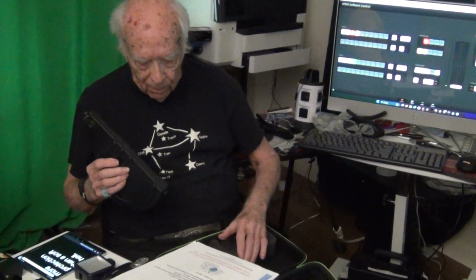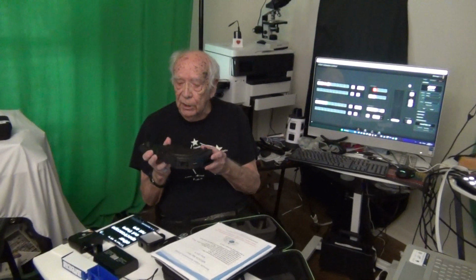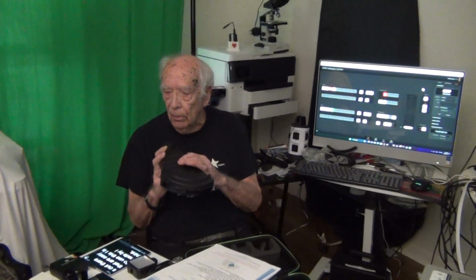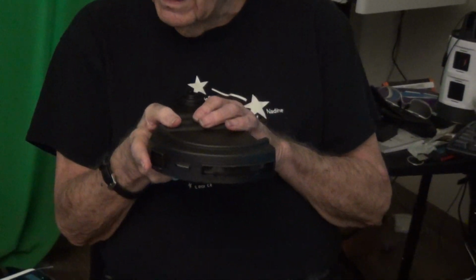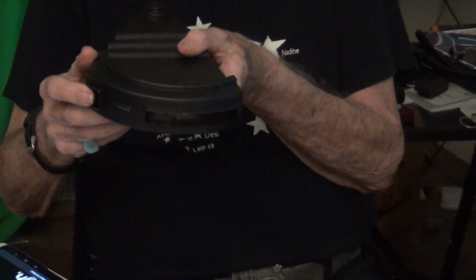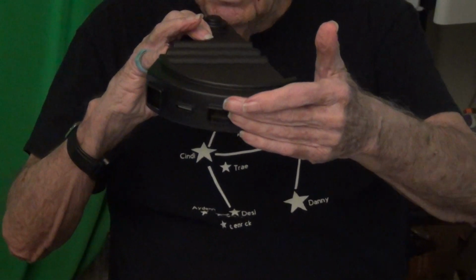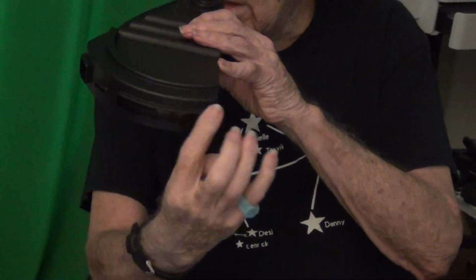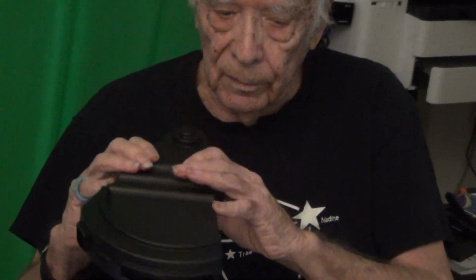Oh yeah, I know which one. There are other spectroscopes out there that are easy to use. This one is made by, I think, Harvard University, and they're made for the educational world. When we talked about that angle, that's where the angle comes in. You're going to look through here and you're going to see your spectrum. That's what I wanted to cover. You're going to see your spectrum in here, and it will have the colors and the numbers in nanometers.